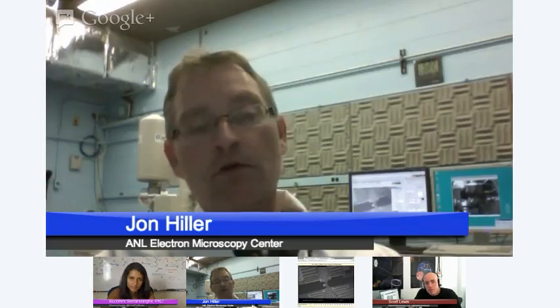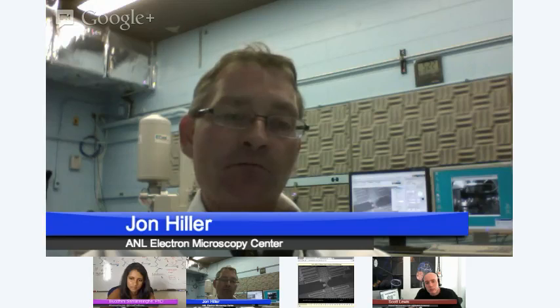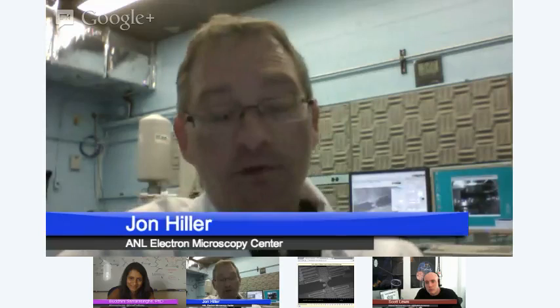you can focus a scanning electron microscope beam down to around 2 or 3 nanometers. You can get even better than that, but I'm just going to about 2 or 3 nanometer probe size. And so when that electron beam interacts with the sample, there are multiple things that happen.